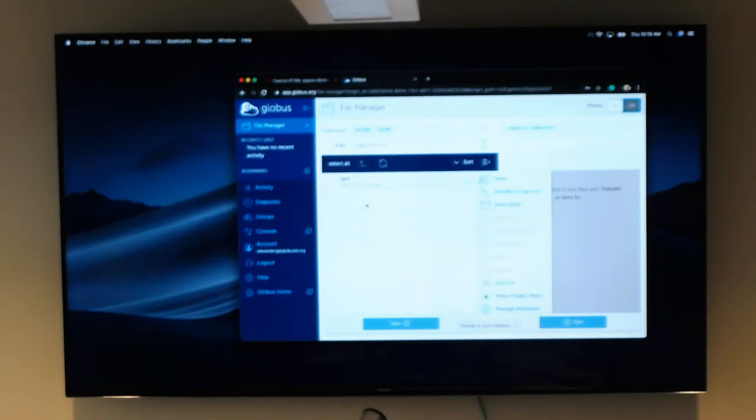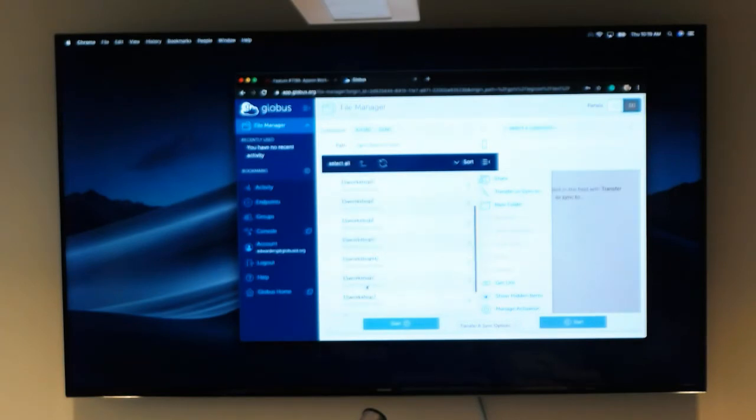So if you go in there, the user account is test. And if you remember, we had different workshop groups. So the instructor workshop group was workshop I, and you can see there's a raw data folder, and you can see these are the 10 images that we were using in the tutorial. Great.